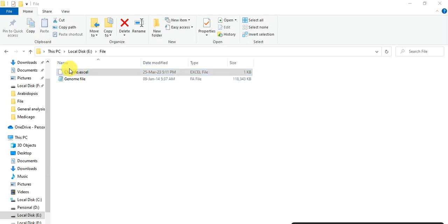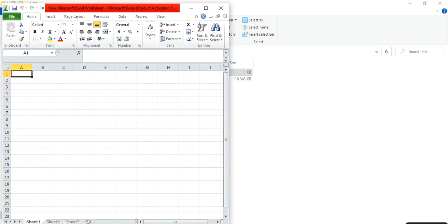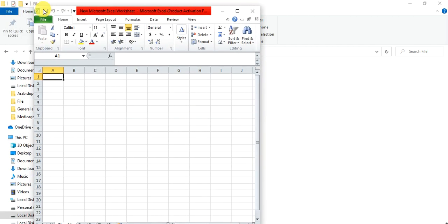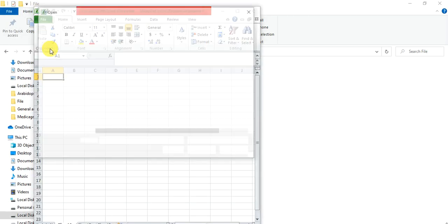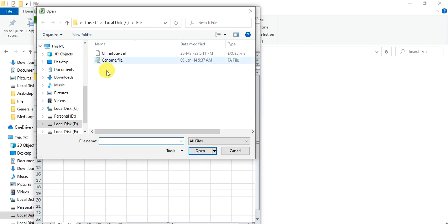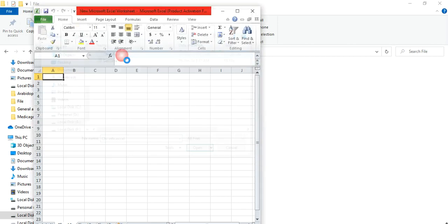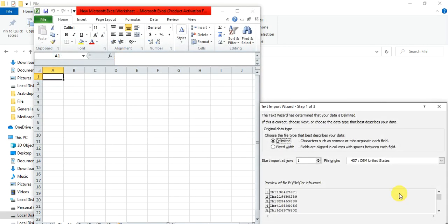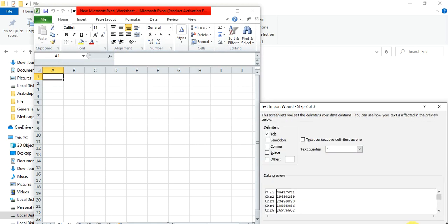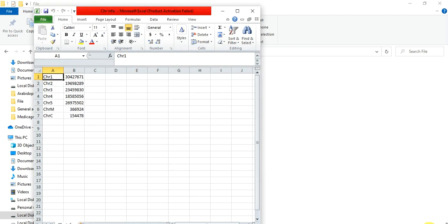So we will open this file in Excel or text format. So if we want to open it in Excel, open any Excel sheet, then go to file, open, and open that in Excel sheet. Next and finish.